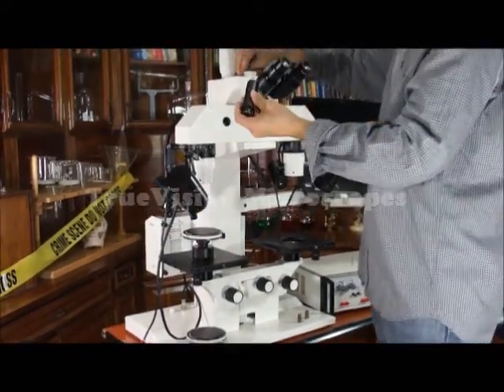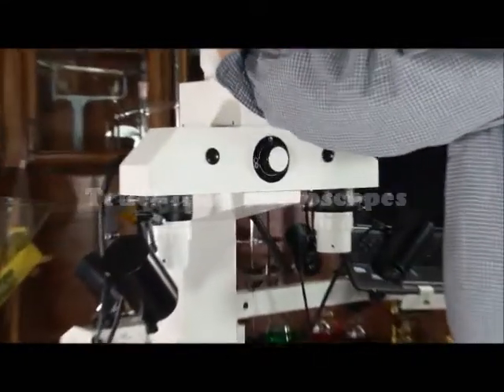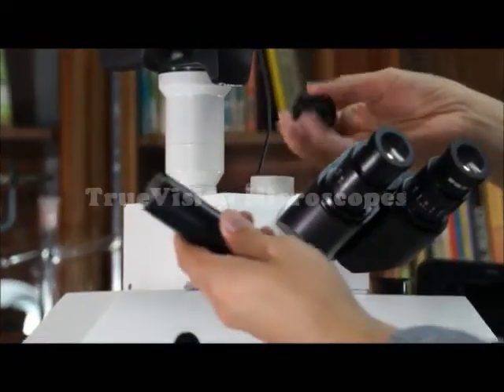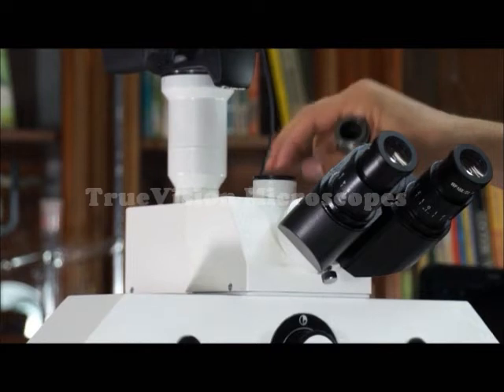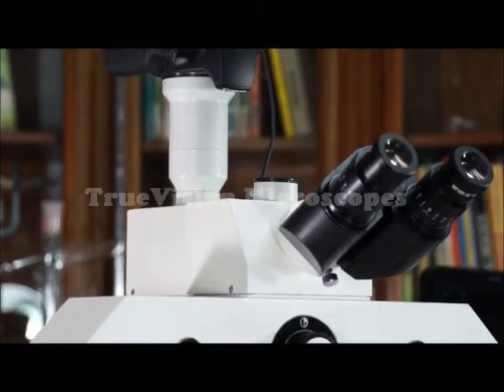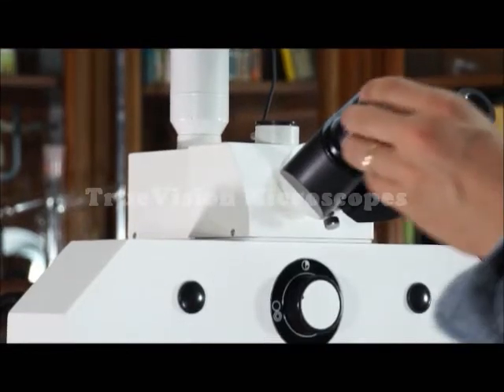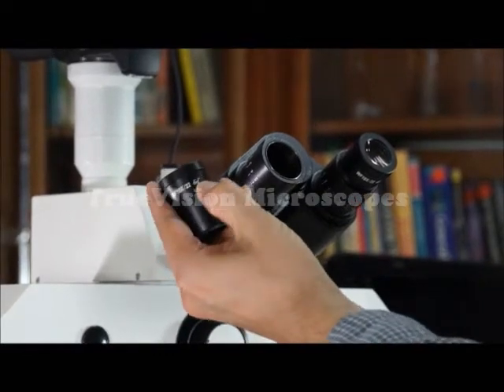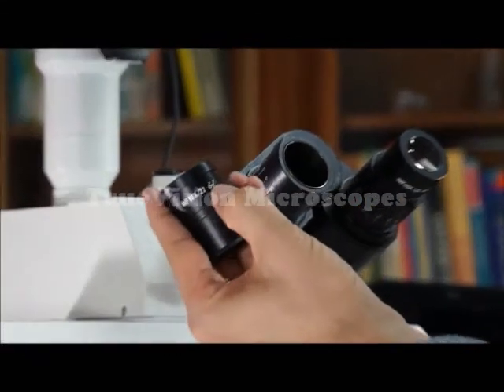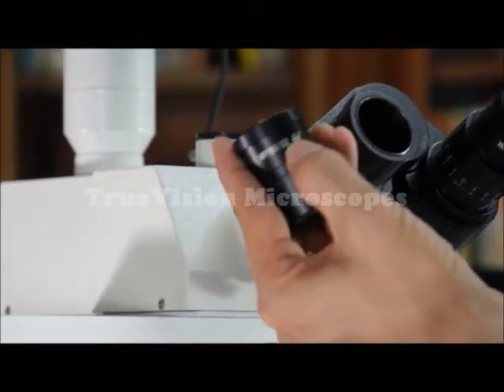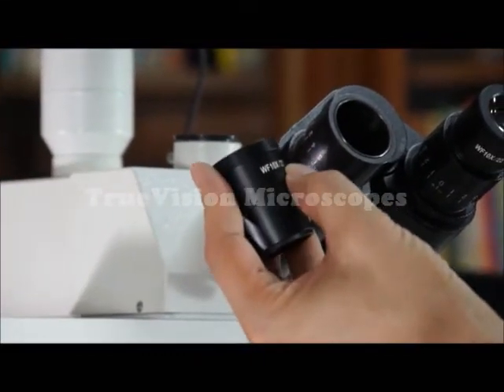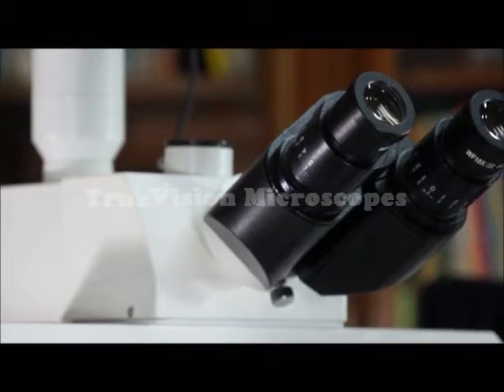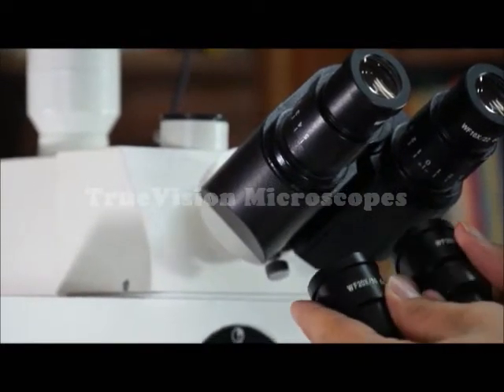These are mounts, optional mounts, mounts for the different cameras. They provide a C-mount. This port is mainly used for CCD cameras. The microscope comes with ten power eyepieces with a high eyepoint for people who wear glasses. So if you wear eyeglasses or you don't wear eyeglasses, you can use these eyepieces. These are wide field 10x by 22mm field of view. The microscope also comes with a pair of 20x eyepieces.